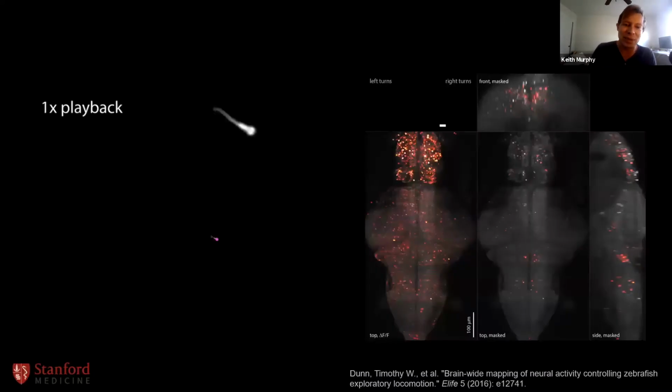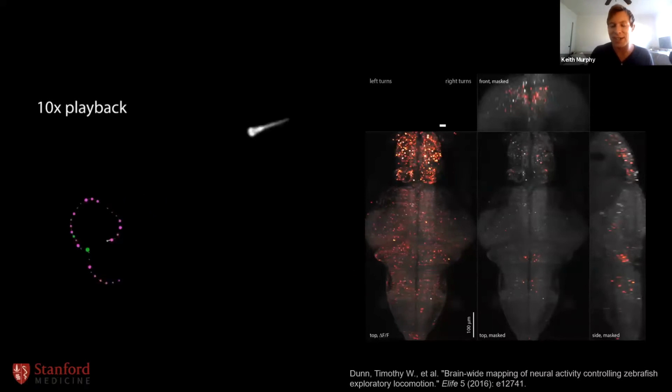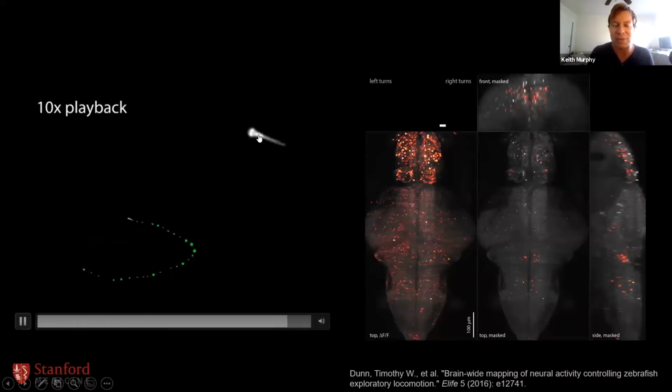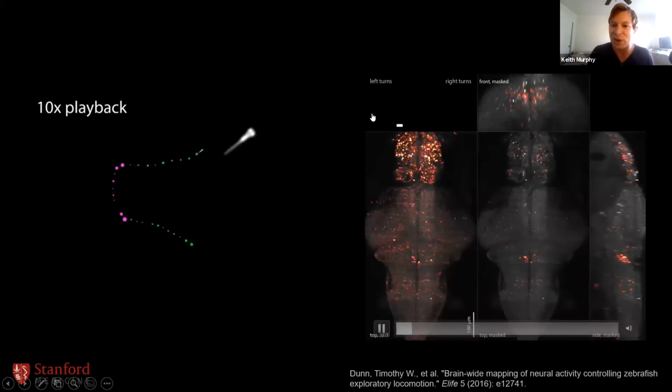So this is an organism that neither Kim nor I have experience with, as far as I know. This is a larval zebrafish. And here you can see that you can track the motion of the larvae very easily in solution. And as we know, having a water tank allows for very easy ultrasound coupling. Now, the really cool thing about the larvae is that you can head-fix these guys with a little bit of sort of crazy glue.